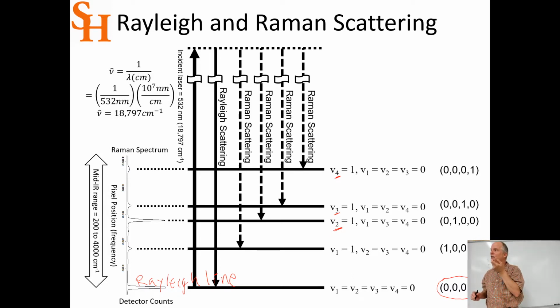You turn up the sensitivity of the detector and then you flash a laser in its face, it's gonna temporarily blind the detector. It's very similar to what you see at night when your eyes are adjusted and a car turns on its headlights. You're temporarily blinded, and that happens to the detectors as well. It can actually damage them too. Then we have the nu 1 transition. So this is the quantum jump and vibration quantum number 1 and 0 for all the others. And so you would label this one nu 1, the next one nu 2, nu 3, and nu 4.